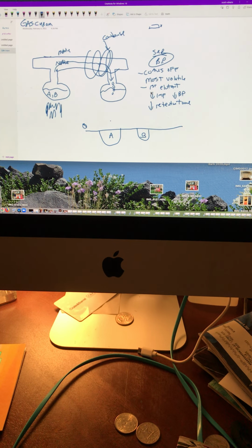What does the noble gas help do? It just helps it move. As soon as you boil it, here's my gas, and it doesn't know where it's going. The noble gas pushes it through, and it's like, okay, I'll go down there, because it's not really thrilled. That's all. It literally just puts it in the mobile phase.